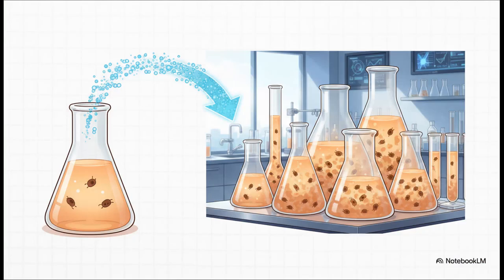So here's the bottom line. You use a liquid broth when your main goal is quantity. Whether you're trying to ramp up the number of bacteria for a big experiment, or you're just trying to maintain a pure stock culture you already have, broth is your go-to tool for amplification.